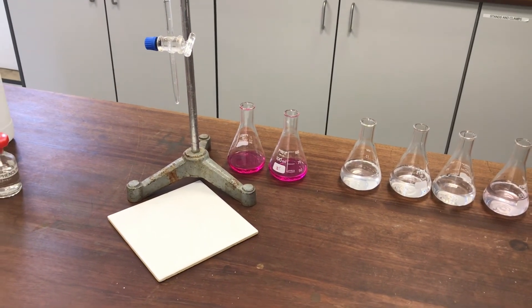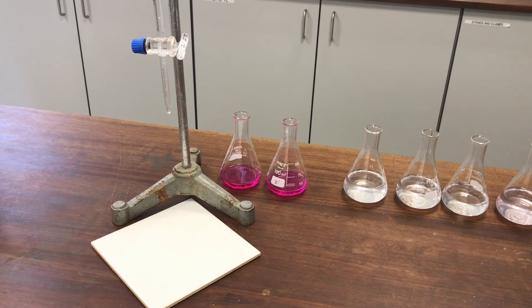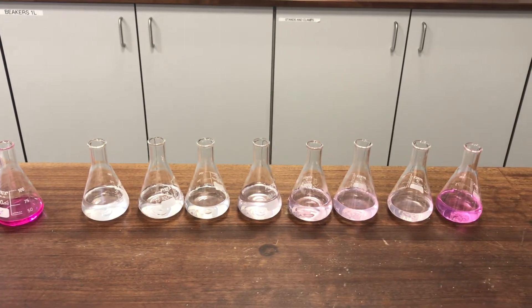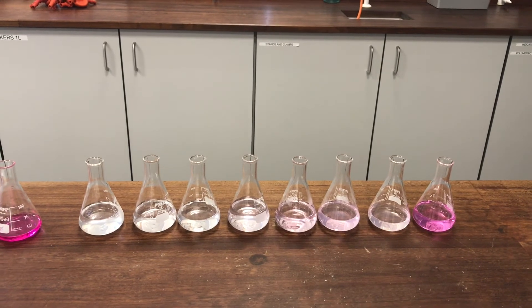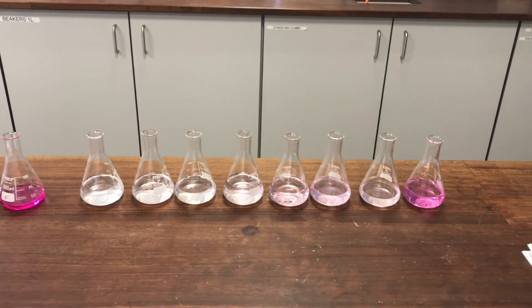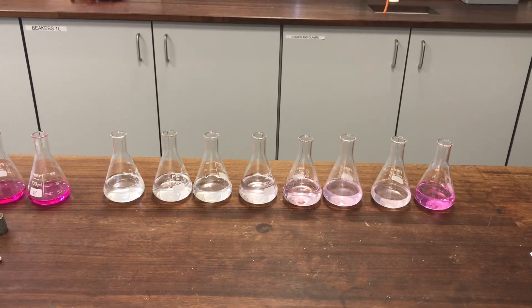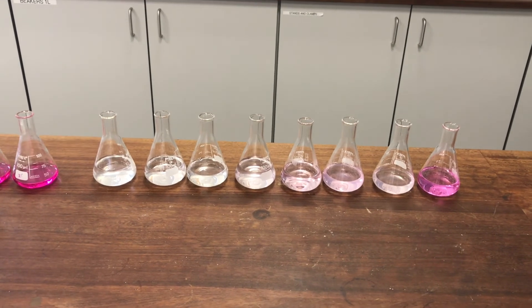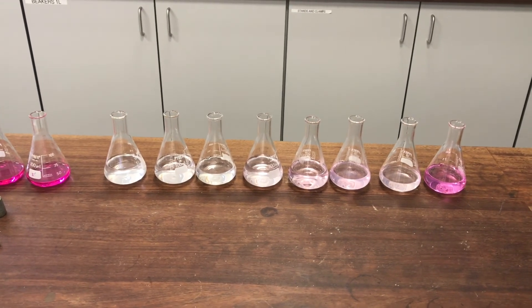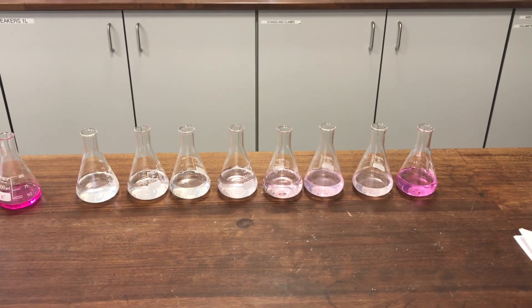I've finished the titrations now - 10 titrations were done in total. The first two that are still pink are the ones where I titrated just the HCl against the sodium hydroxide. The others are the equilibrium mixtures. You'll notice they've started to change colour and are not still pink anymore. That's because during the time it's taken me to do all these titrations and write up the data, they've actually started to shift in terms of their equilibrium positions. The equilibrium position will have shifted to try to produce a little bit more acid to replace the stuff that got used up.